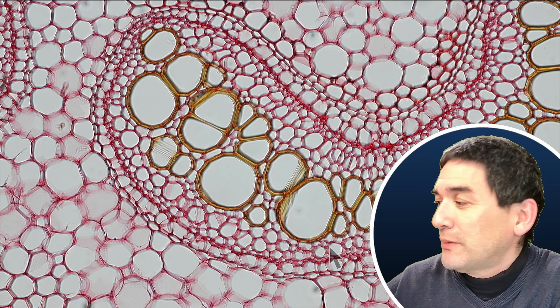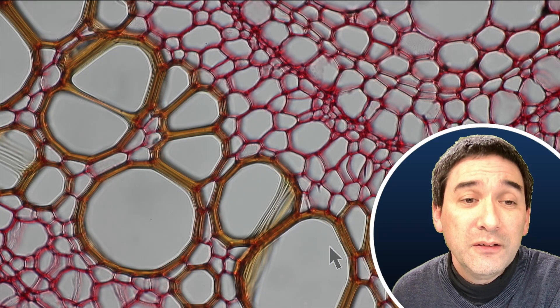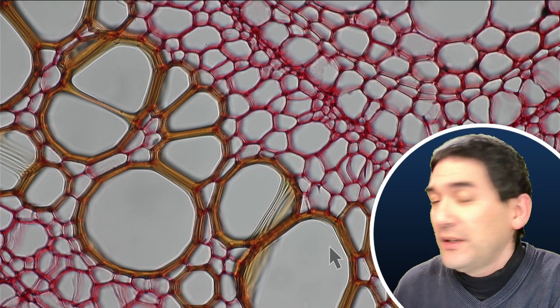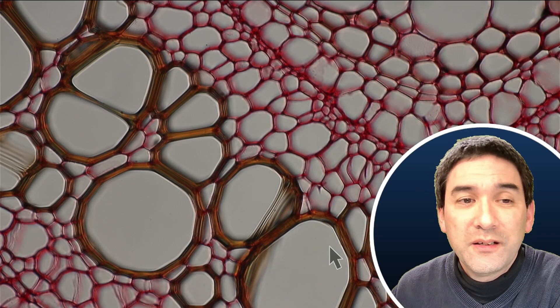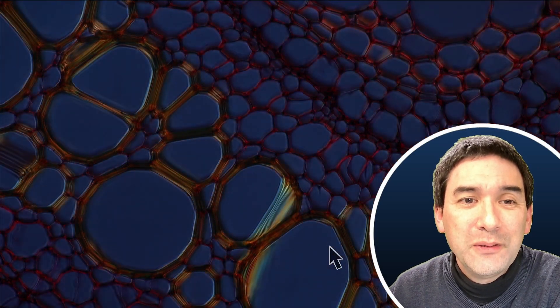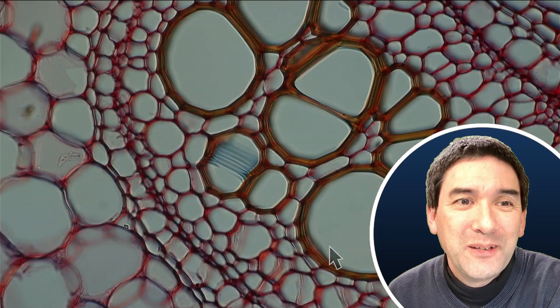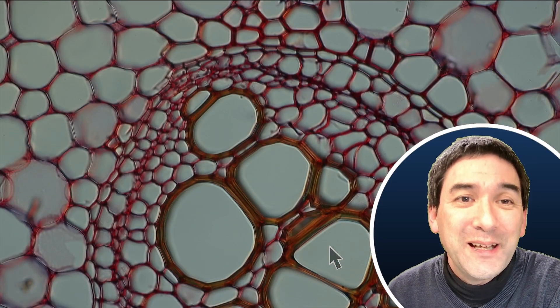And therefore the patterns and the arrangement of the individual cells are visible much better. So I think this is a very nice specimen. If you want, we can actually go up a little bit further with the magnification. This is now 40x magnification and everything is in bright field. But if we were to switch on now so-called DIC, differential interference contrast, then we're able to change again the appearance a little bit and then we're also able to rotate the knob here to also change a little bit the colors because the microscope also uses polarized light and therefore I'm also able to change those colors. So you see, plenty of things to play around with. A very nice specimen.